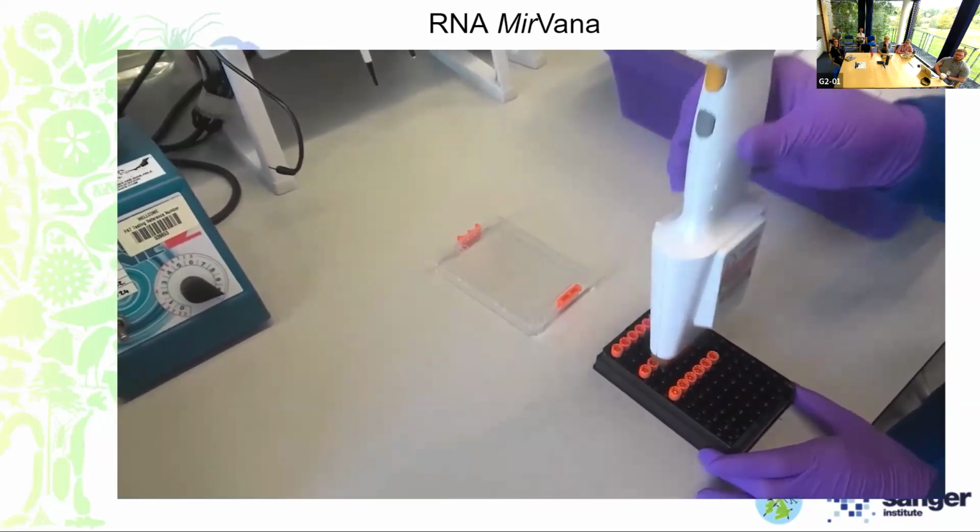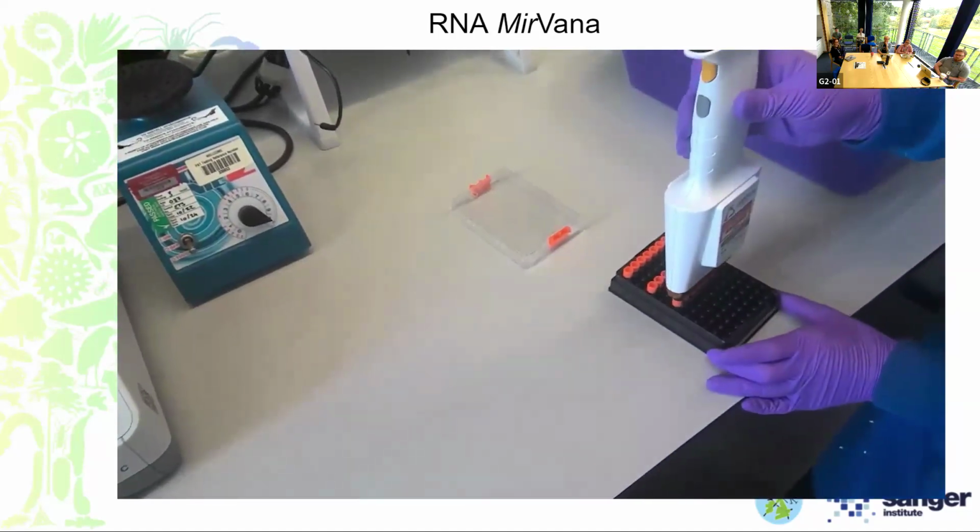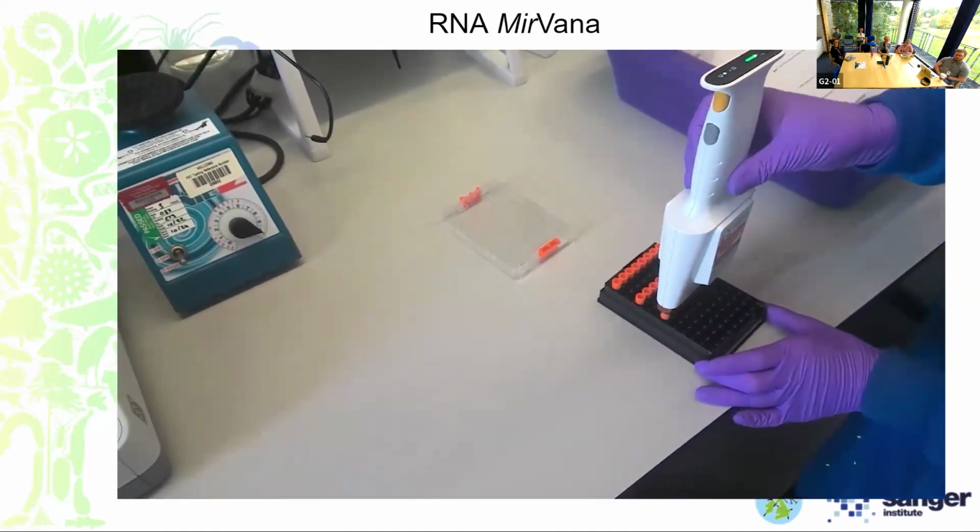But yeah, it's very important that once you have done the transfer, that the RNA goes back on ice, again, just so there's no degradation.